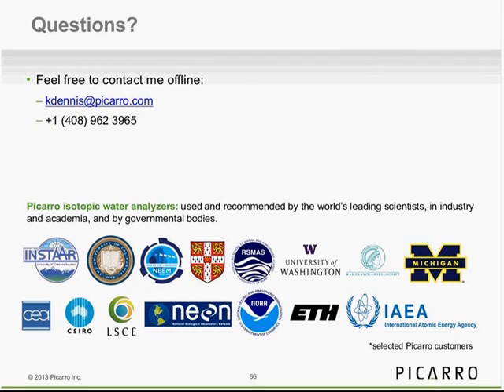So it's a very good question. Soil water, we have had more issues with running soil waters on the IM than leaf waters. So I typically say to anybody who wants to run soils on the IM, try it, but you might also want to do some other methods.